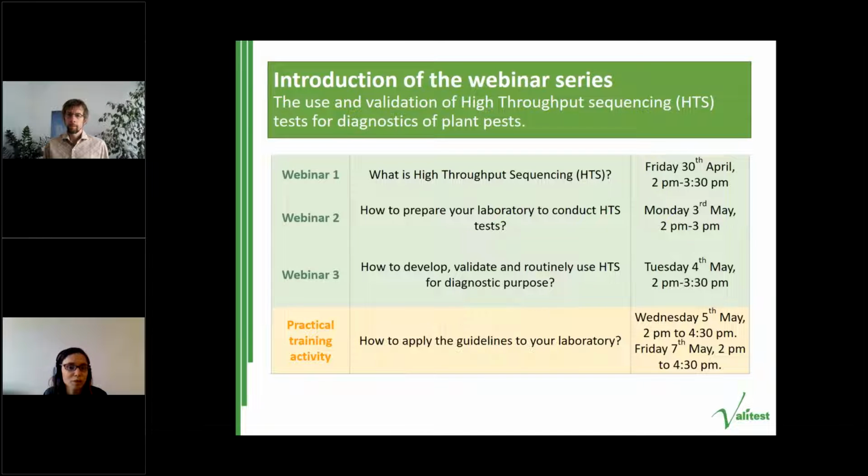Today's webinar will be an introductory session and will give you an overview of the HTS process, including the different steps in the laboratory and for the bioinformatics analysis.